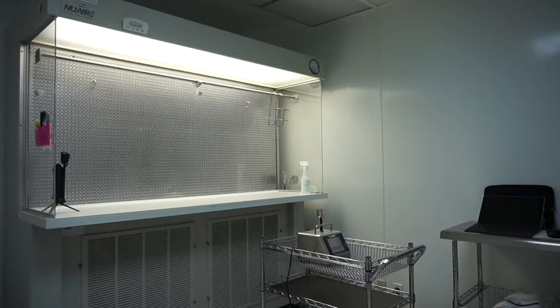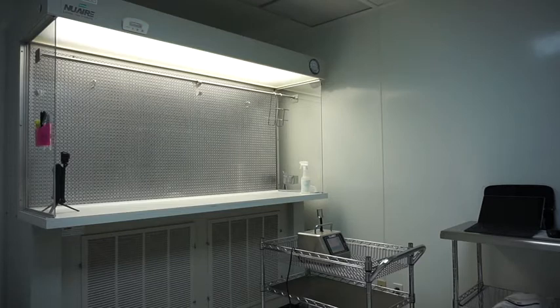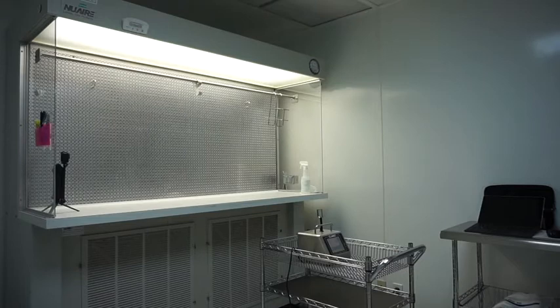Their regular habits - going over to a pass-through, opening a door, moving about the room in a normal manner to simulate dynamic conditions.